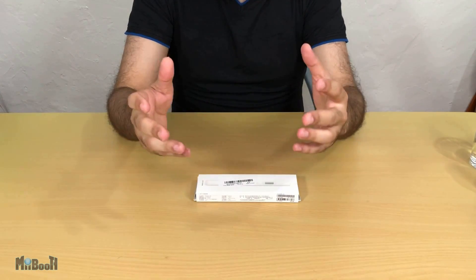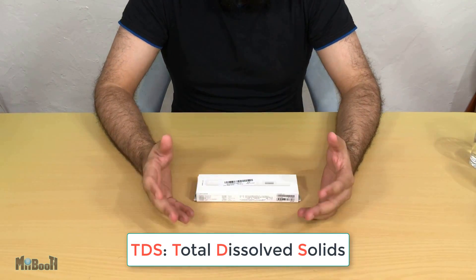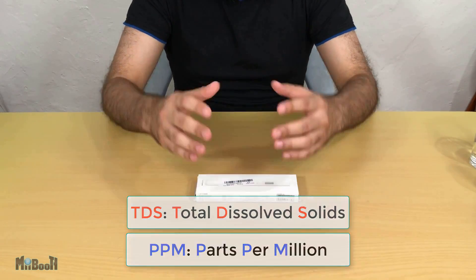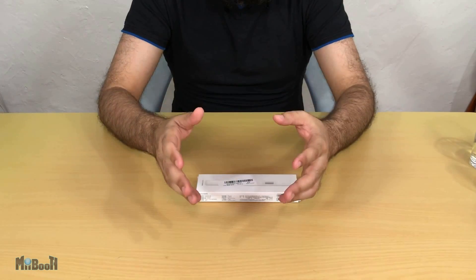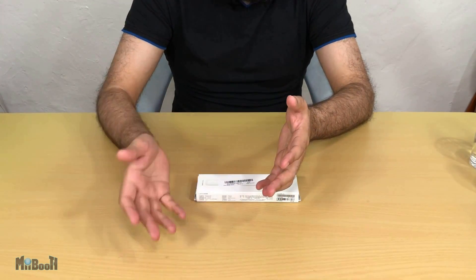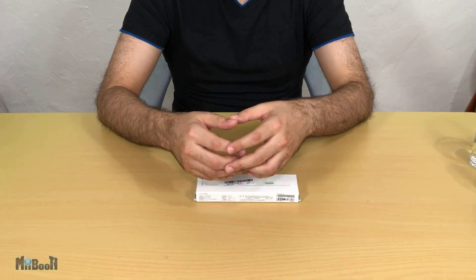Let me give you a short explanation about TDS. TDS stands for Total Dissolved Solids and is measured in milligrams per liter, or parts per million — ppm for short. No matter how clean your water is or which factory it comes from, it will always have a certain amount of dissolved solids in it, and it is not always a bad thing. These solids are usually a combination of salts, minerals, cations, anions, and sometimes organic material.